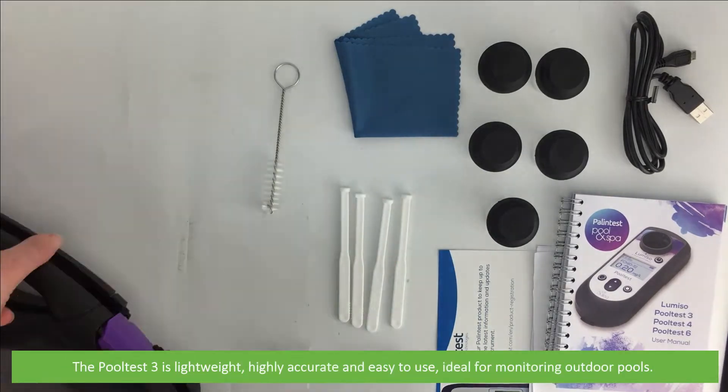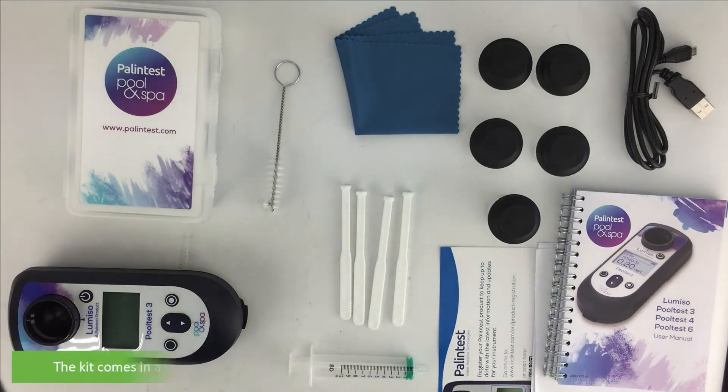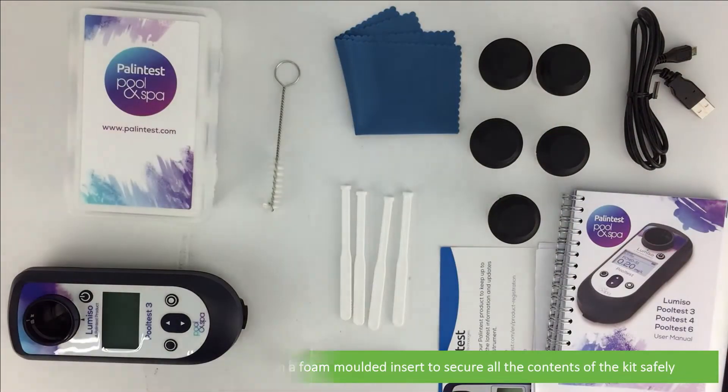The Pool Test 3 is lightweight, highly accurate and easy to use — ideal for monitoring outdoor pools. The kit comes in a hard carry case with a foam molded insert to secure all of the contents of the kit safely.